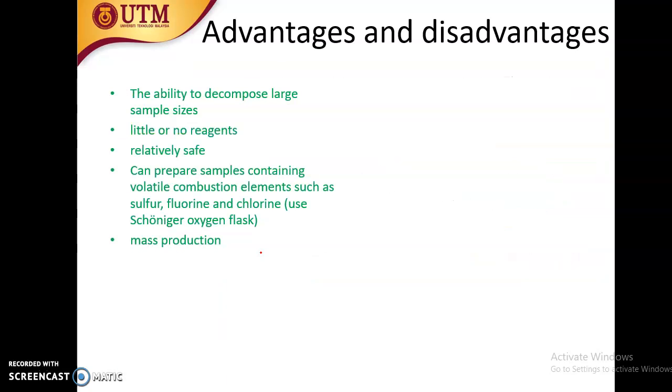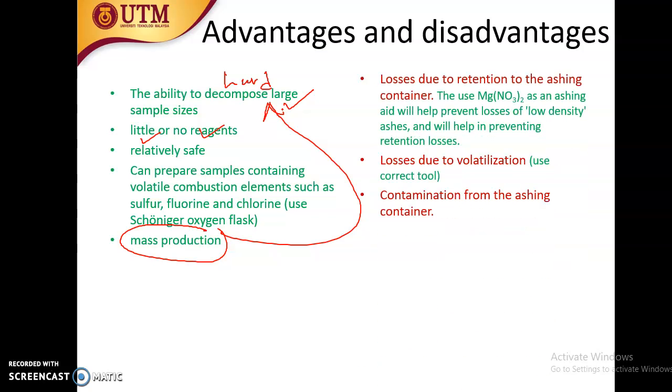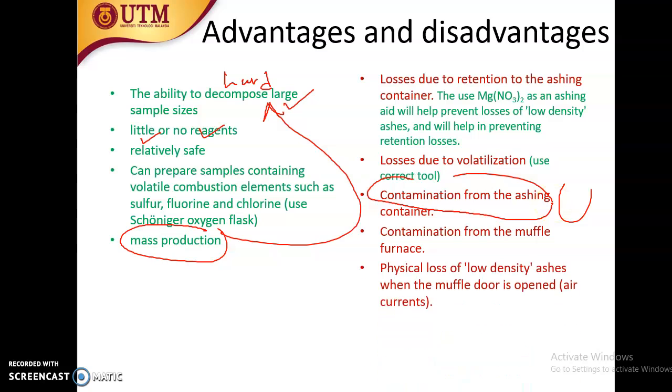The advantage of ashing is that it is able to decompose hard matrices and large sizes of sample, with little or no reagent, because if we are using wet ashing, you are using only a few mils of acid. Relatively safe. But we have to take care of the contamination from the container itself, the muffle itself. And also we can lose certain analyte due to volatilization.